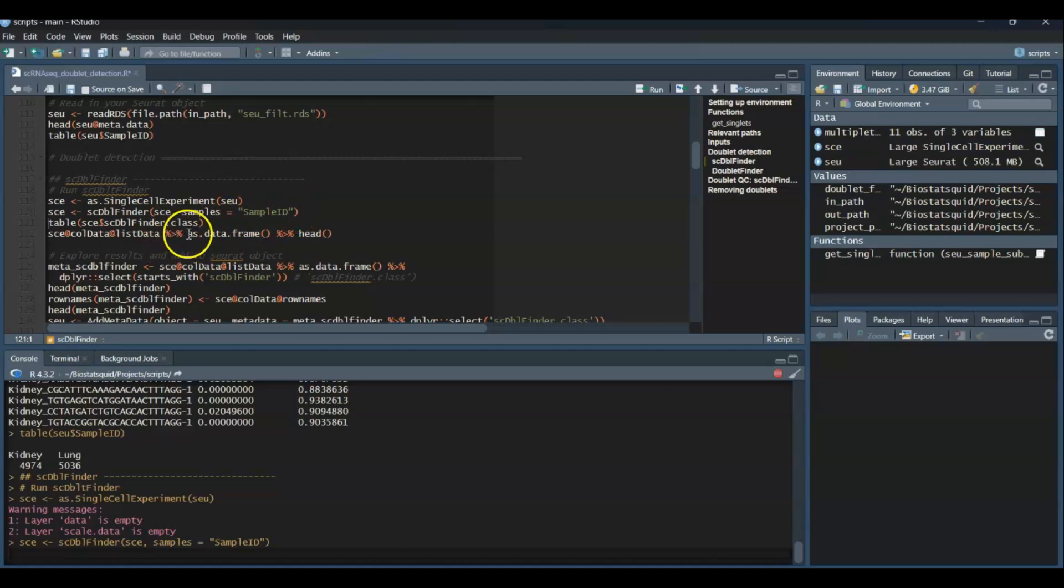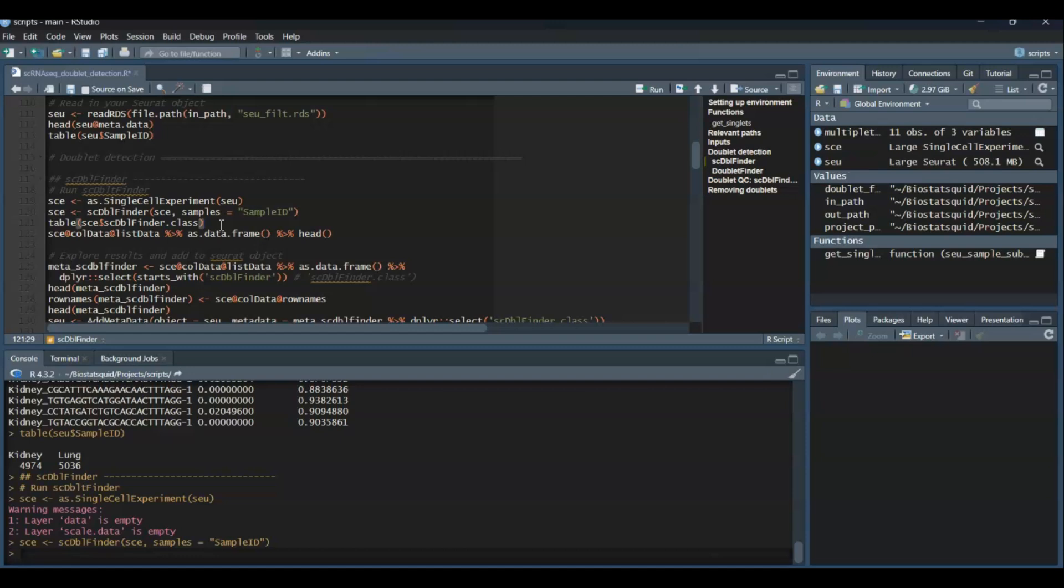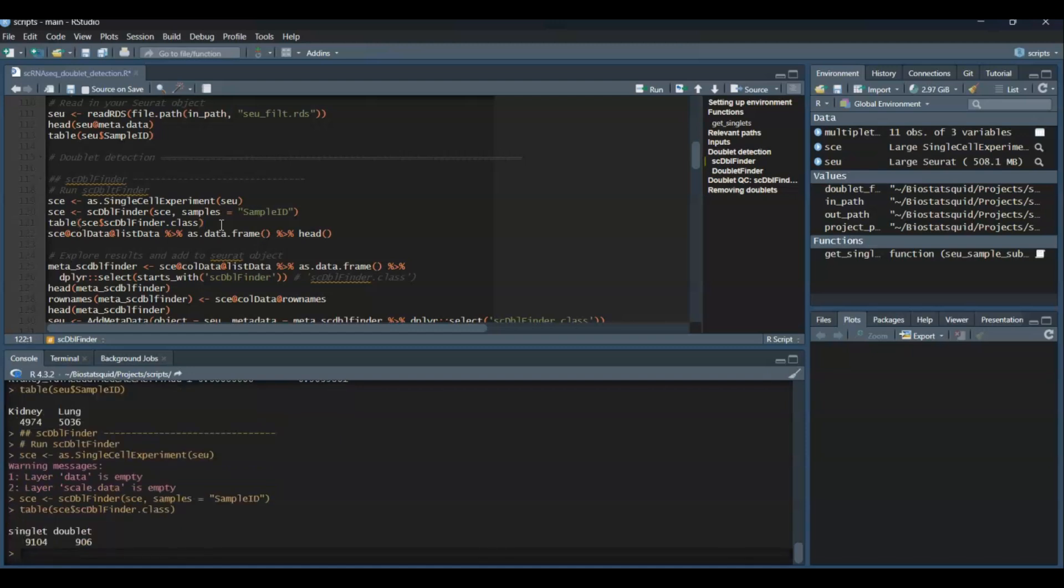Let's have a look at how many doublets and singlets we found. So let's see, the labels will be stored in the metadata column called scDblFinder.class. So we need to wait a bit till the function finishes running. It can take more or less time, depending on the size of your Seurat object, so how many cells you have. Cool. So when the function finishes, you'll see that in our case we found this number of doublets and singlets.